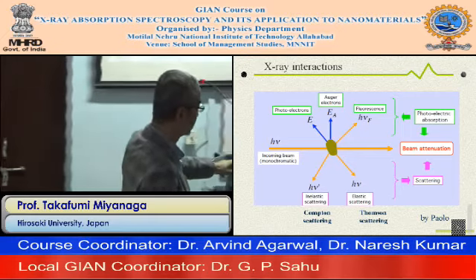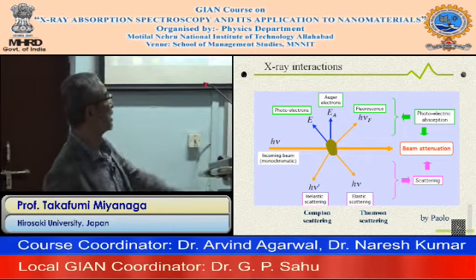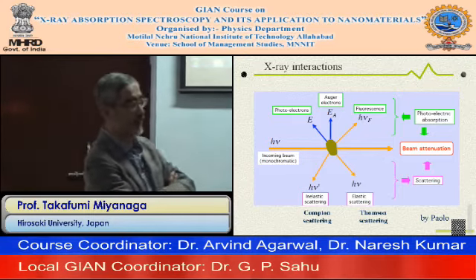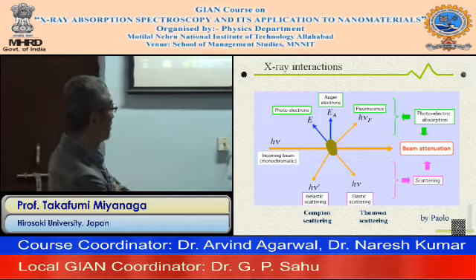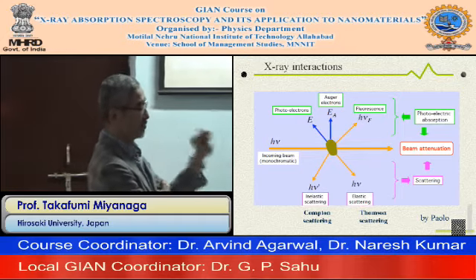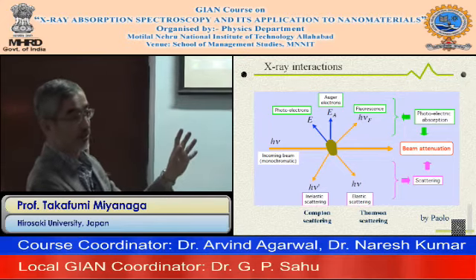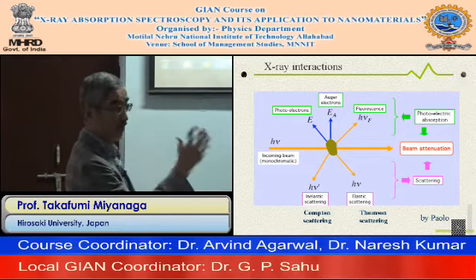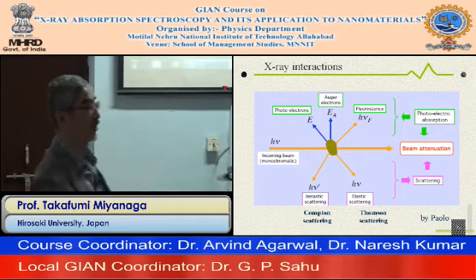And after that, Japan has a plan for the new 3 GeV beamline synchrotron radiation facility, because the 3 GeV is very high brilliance and sharp X-rays in the intermediate energies. So now the science is focused on such intermediate tender energy regions.